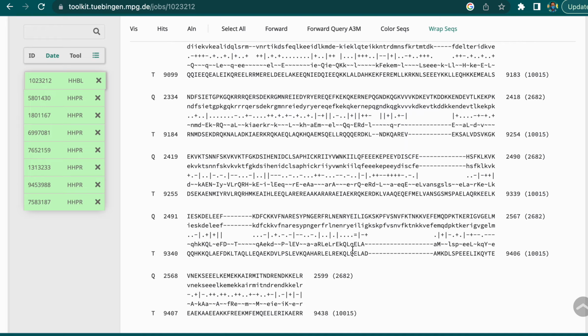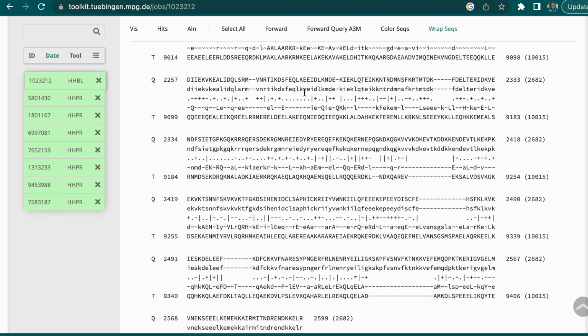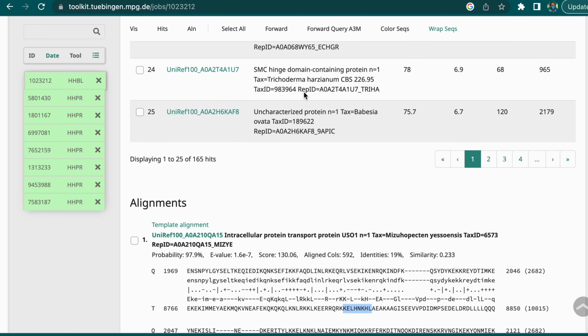So there you go. And generally you want to look for a more cluttered version of the middle with more little bars in it. Inside of this, there will be little guides that can take you through what each of those little symbols mean. So there you go. That's your stuff.